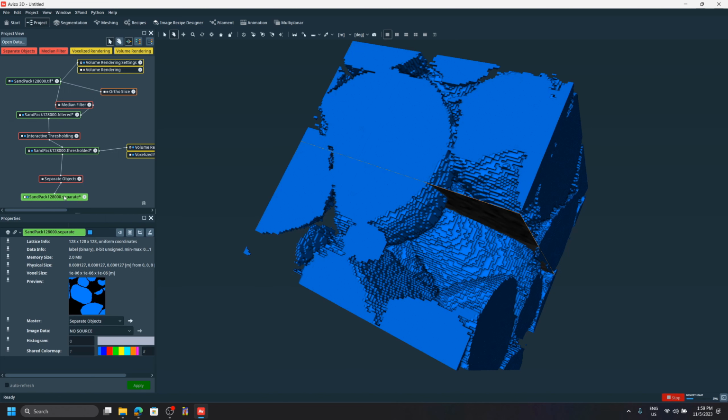All right. So it generates a new version of the data set, but now the particles are separated. So I can take a look, and now you see here, for example, that there's a crack that separates these two particles. And even better, we can do a label analysis, which will assign a different material to each particle, okay? And you get something like this.